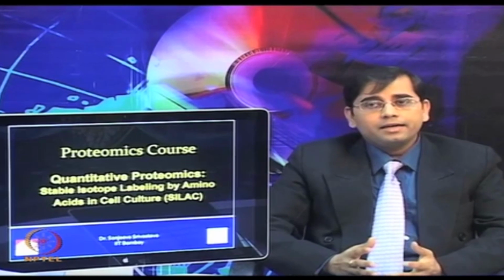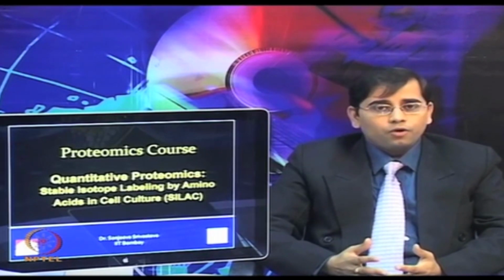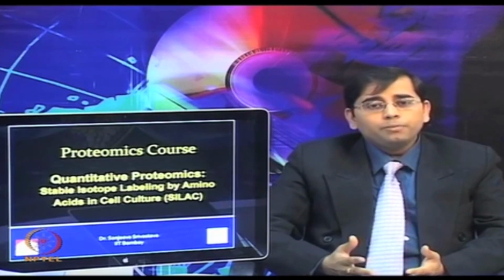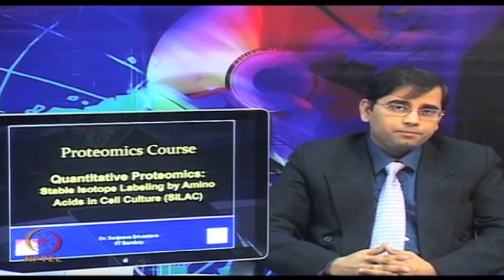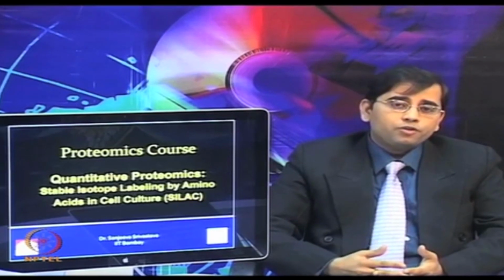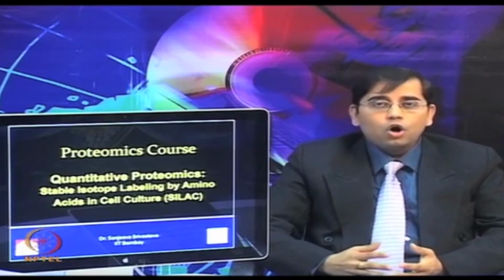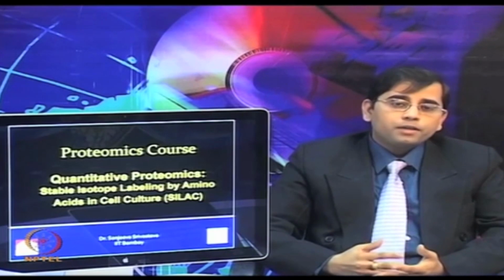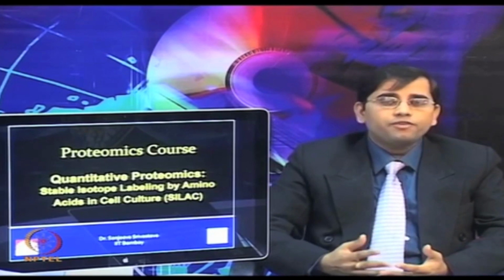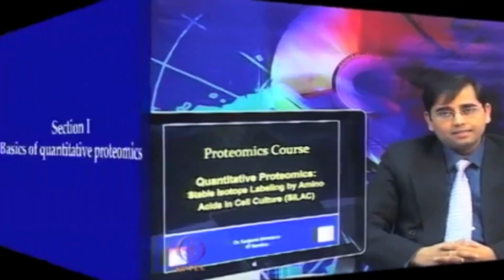Many advancements in MS during the last decade have provided new ways for protein analysis and facilitated the proteomic analysis of various biological systems. Advancements in MS include the development of highly sensitive mass spectrometers, fast scan rates, automation, nanoflow liquid chromatography, as well as new techniques and methods to quantify protein abundance for quantitative proteomic analysis.